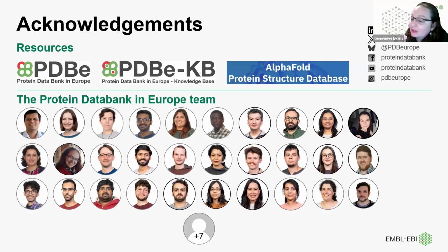So you could also consider contacting the authors potentially as well, because one of the nice things that's evolved over time at the wwPDB is we have the capacity to version coordinates. So if the coordinates are the problematic thing, and the scientists who deposited it are still active in the field, they might be willing to revisit their structure. There might be something that they're willing to do. So you could contact them and ask them about it. And that is possible. If you discover there's an issue with your structure, you can contact us and we will unlock the deposition interface so you can upload a new version of the coordinates that's more appropriate for your experimental information.